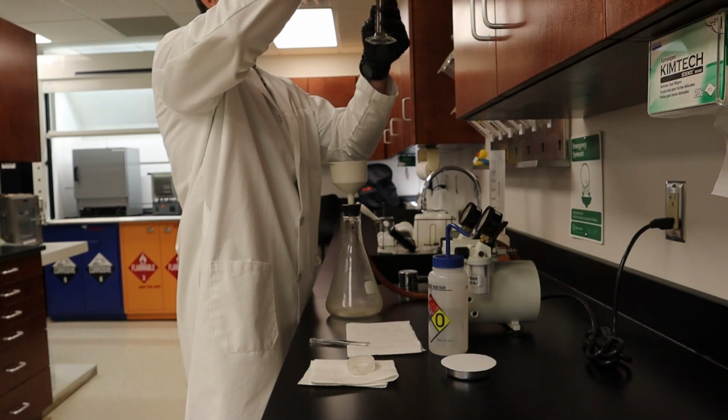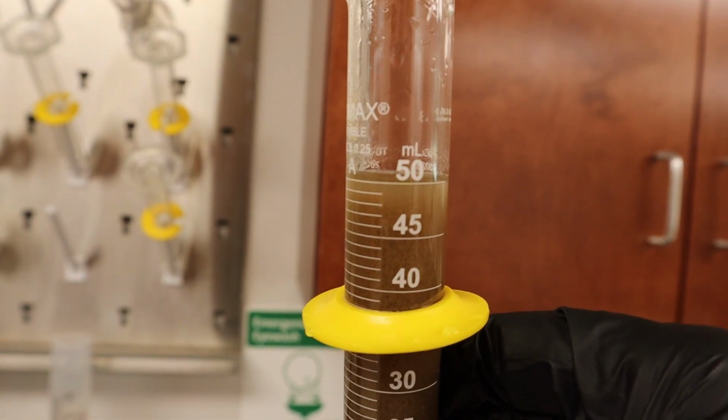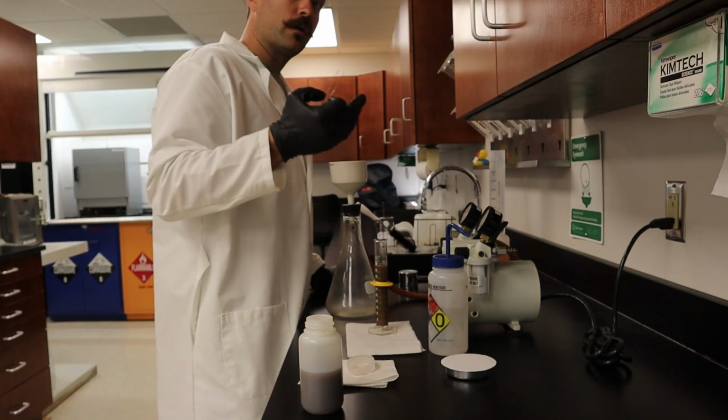I've got it at eye level or a 90-degree angle so that I can see my bubble or meniscus. And there we go. We've got it dead on 50. And now we are ready to seat our filter.